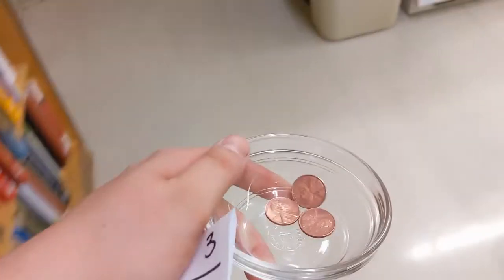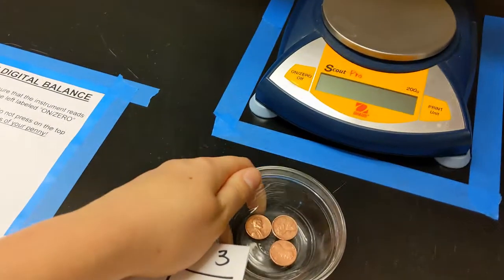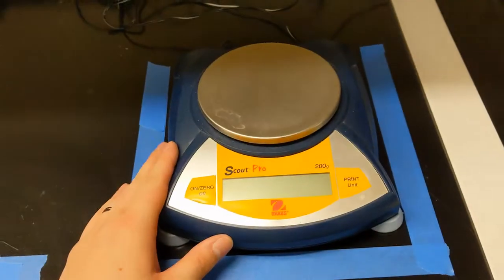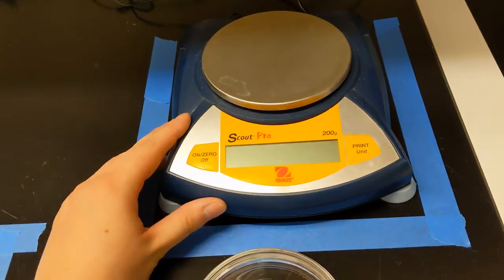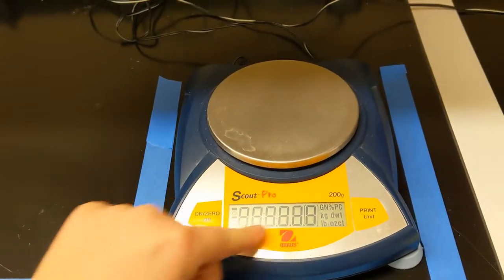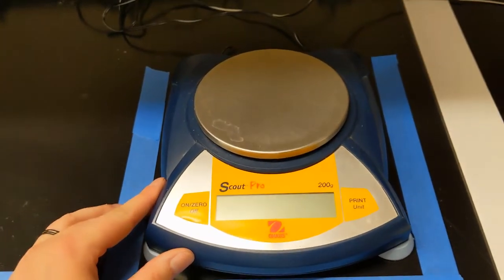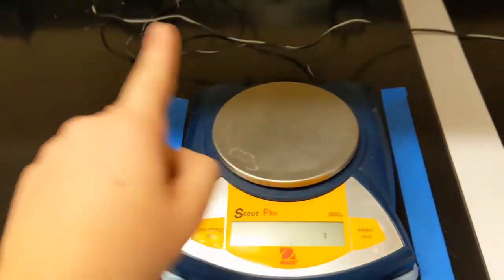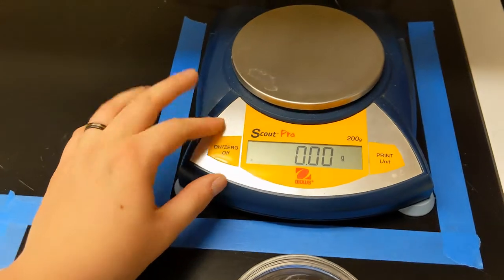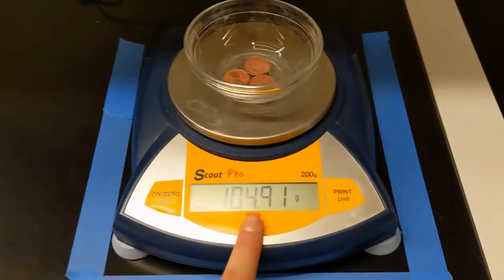I am unable to move my camera rig over to the digital balances, so come with me using my phone camera. This right here is a digital balance. So a balance measures mass, and a digital one gives you the output as digital numbers. You may be familiar with more of the manual type masses, for example, at doctors' offices where they have to move the little weights back and forth. But this is much more convenient because we can just set our object on top and it reads out our mass.